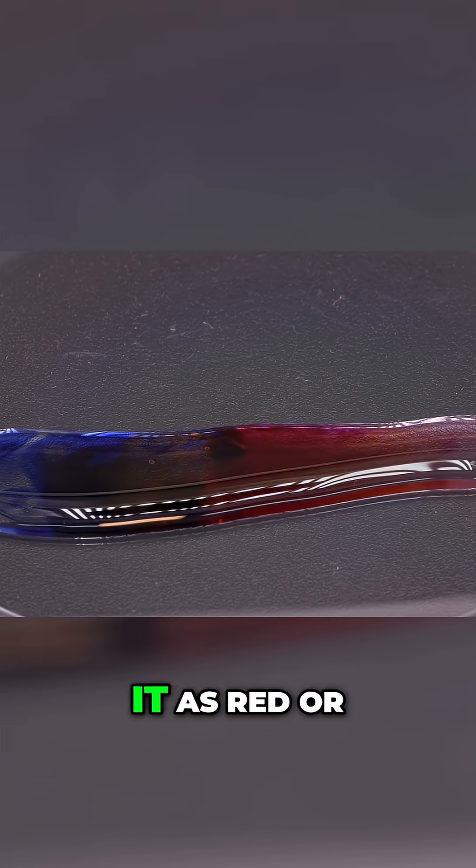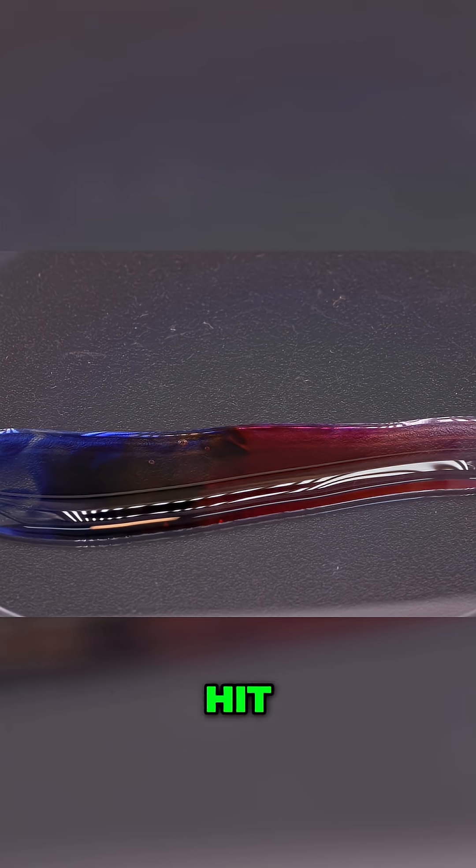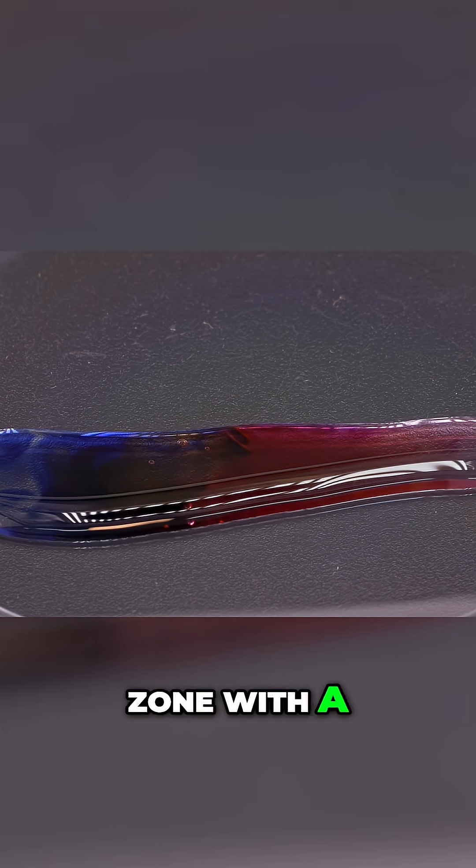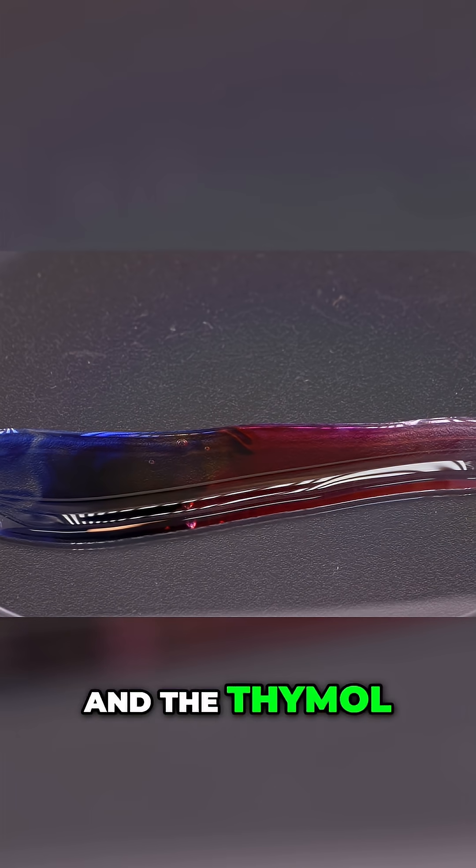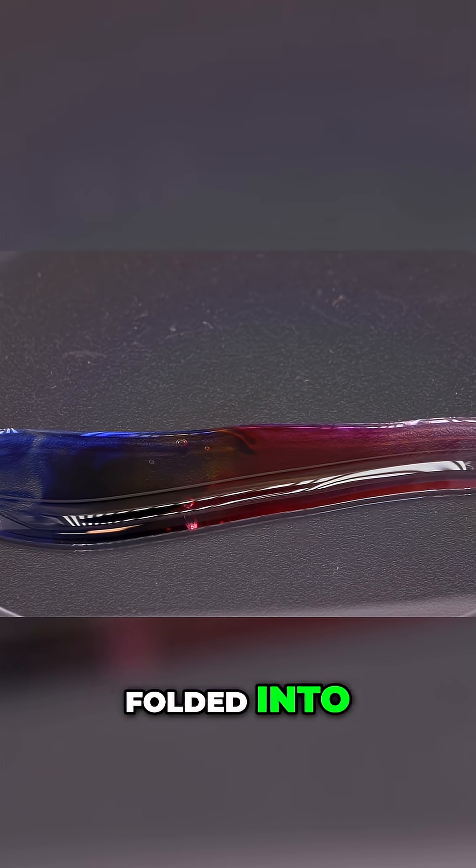And our eyes see it as red or yellow. So when the first drop of acid hit, it created a tiny zone with a very low pH. And the thymol blue there instantly folded into its red shape.